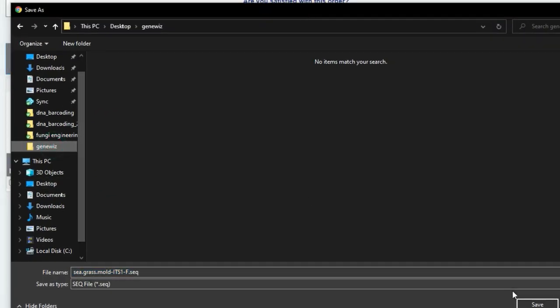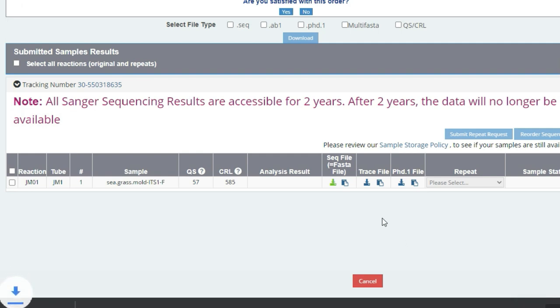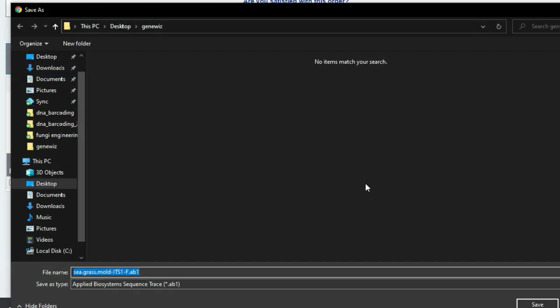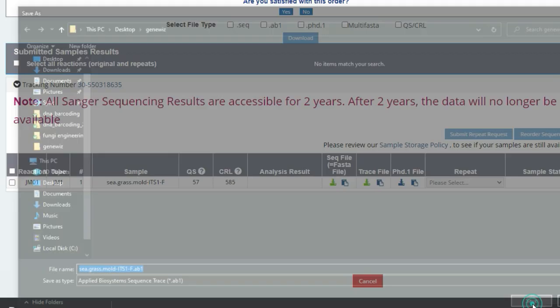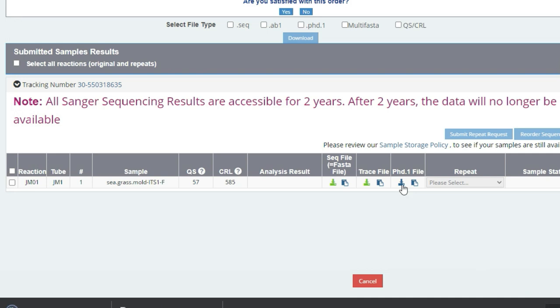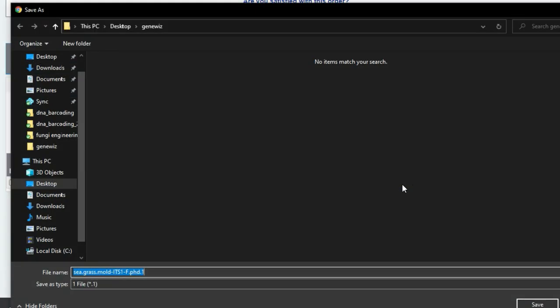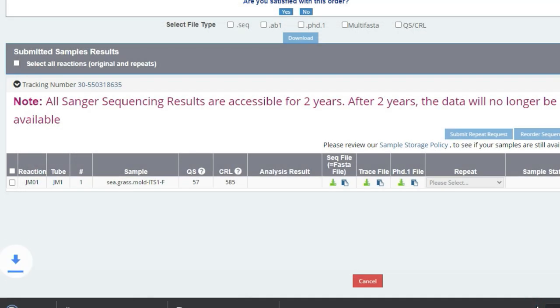We start off with the sequence file, the trace file, and then finally the fred file which we will download. And that takes us to the next segment which is analyzing the sequence results.